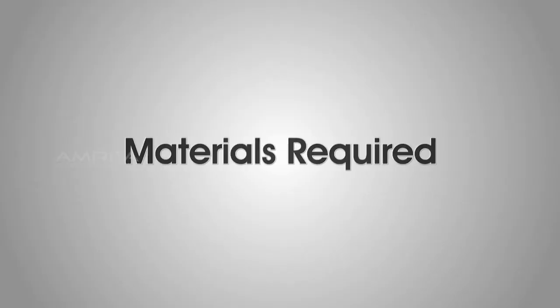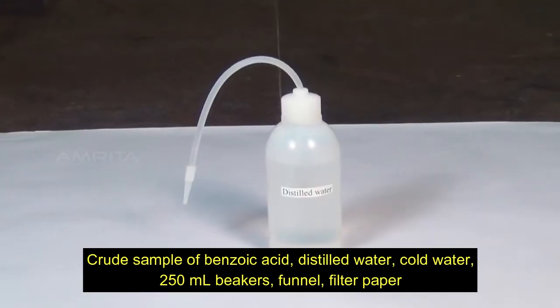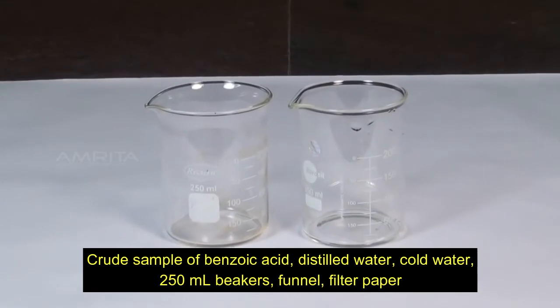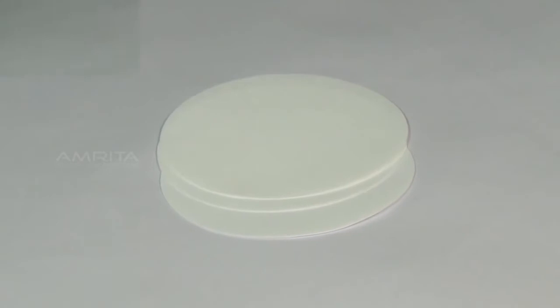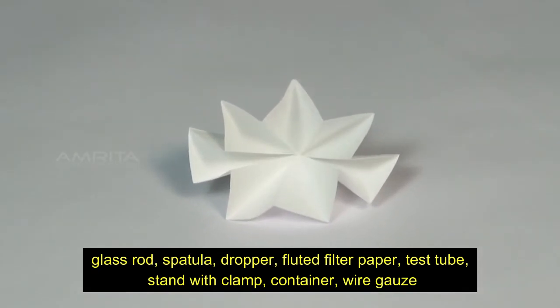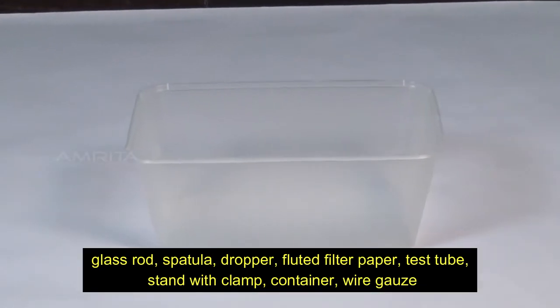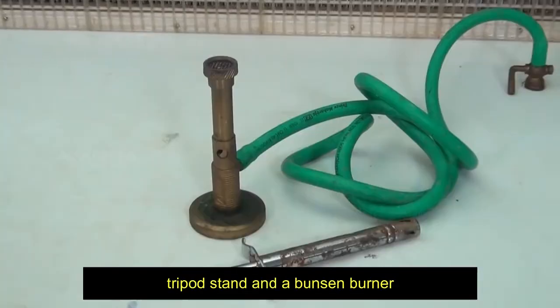Materials required: crude sample of benzoic acid, distilled water, cold water, 250 ml beakers, funnel, filter paper, glass rod, spatula, dropper, fluted filter paper, test tube, stand with clamp, trough, wire gauze, tripod stand, and a Bunsen burner.